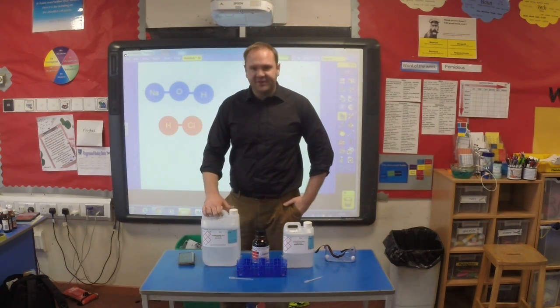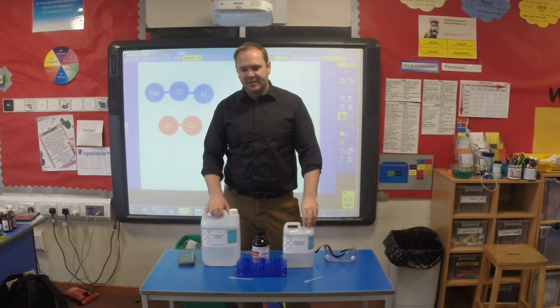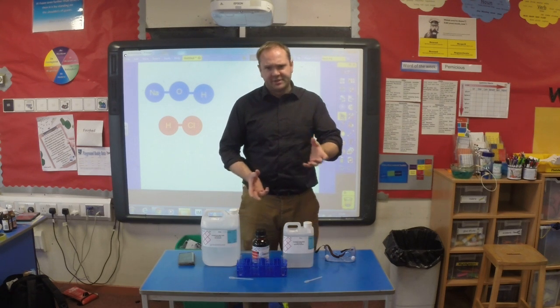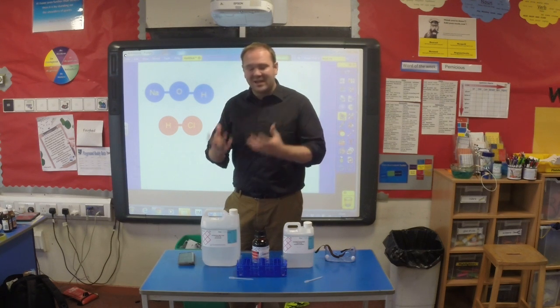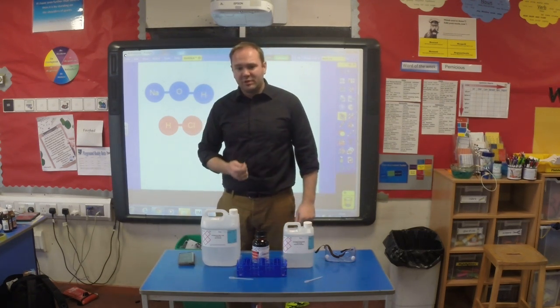Hi guys, in this video we're going to be looking at a lesson that you can do involving acids and alkalis, which ties into anything to do with chemical reactions. So the mixing of two other substances to produce a new substance. This is quite an engaging experiment for kids to try, and it's something that they grasp really easily.